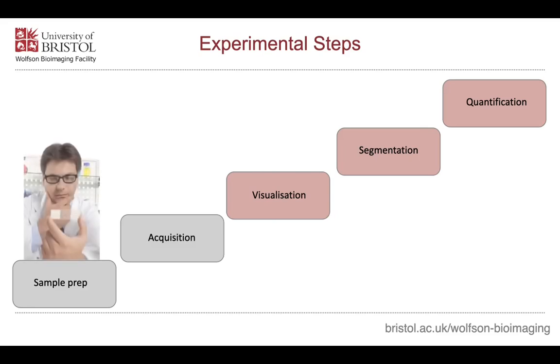What do I mean by this? Well, you've got to consider how you're preparing your sample, so using the appropriate mounting medium. First of all, I suppose you've got to consider using the right cover slips. So number 1.5 cover slips for high-resolution microscopy, high tolerance cover slips preferably will give you the best quality images, and you've got to clean them first, so don't just use them straight out of the pack. Take them and maybe acid wash them ideally. If not, just 100% ethanol cleaning, and store them in ethanol before using.